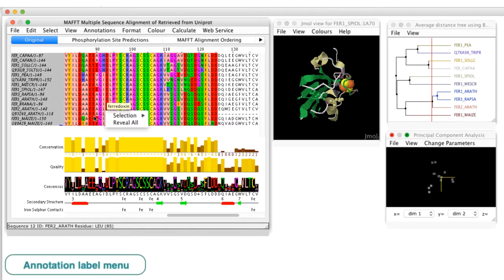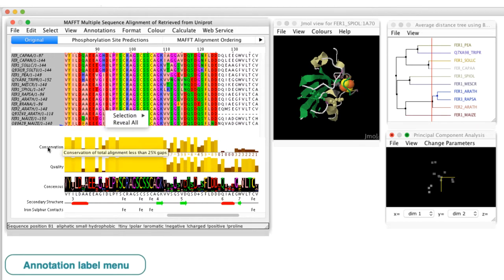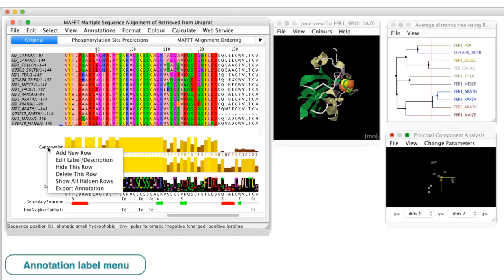The annotation label context menu is opened by placing the cursor on the annotation label panel and right-clicking the mouse.